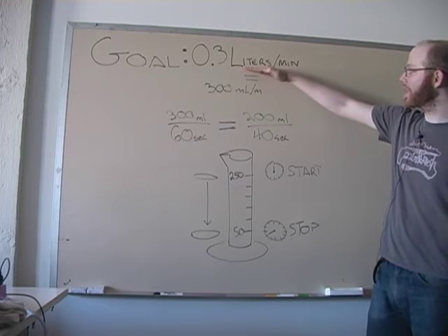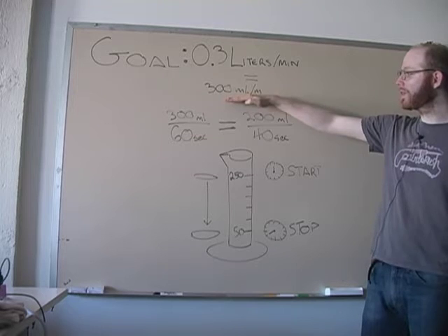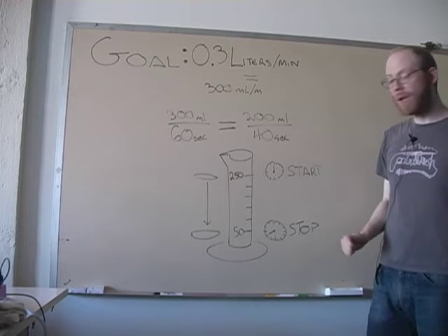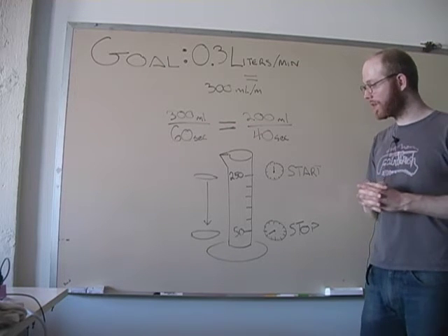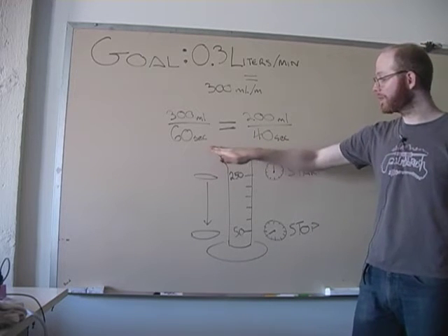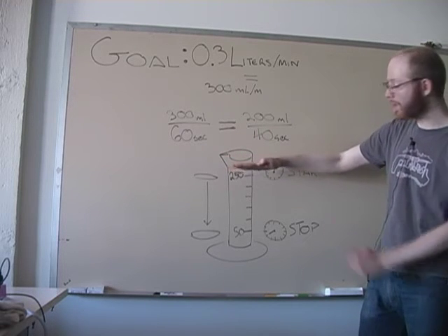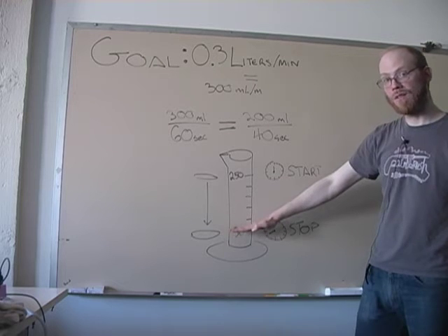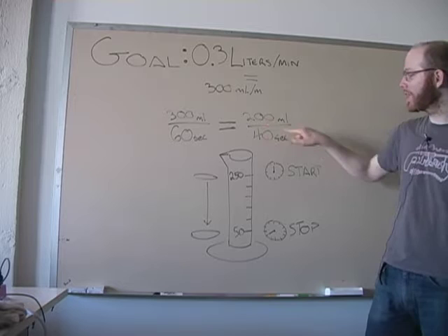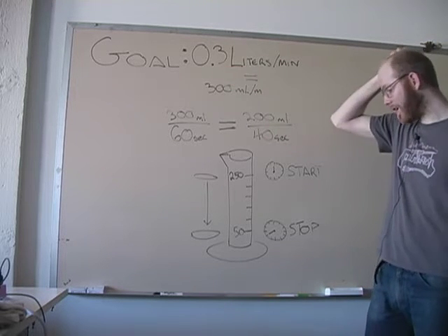0.3 liters of air is equal to 300 milliliters, so we can get 300 milliliters per minute or 300 milliliters every 60 seconds. We have a 250 milliliter graduated cylinder. We're going to start a film of soap bubble going across the top and then time it as it travels down, starting a timer at 250 milliliters and stopping at 50. Over that 200 milliliter period of time we're going to try to get to 40 seconds.